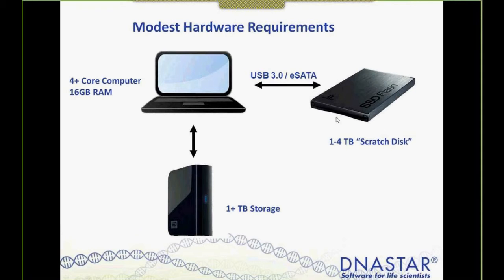And as long as you have that disk, most of the newer laptops now, you can run exome assemblies. It might take a little longer than a big desktop computer, but we're talking, maybe 3 hours versus 2 hours. So we get really good, fast performance on relatively modest and inexpensive computers. And if you have questions on hardware, I'd be more than happy to answer any of those kind of questions that you have.